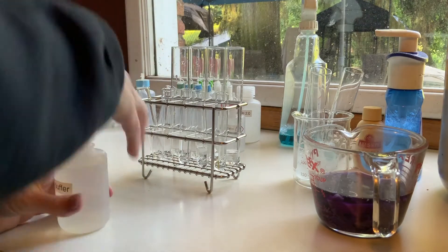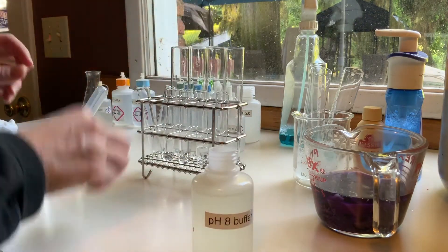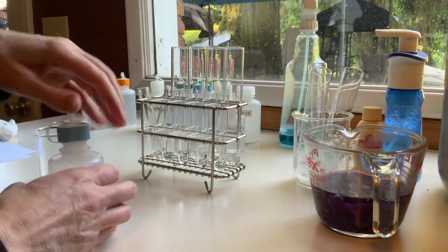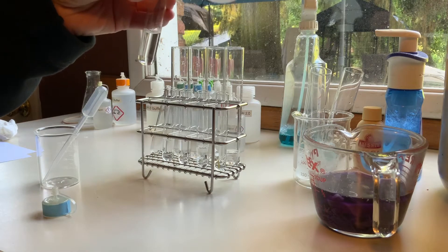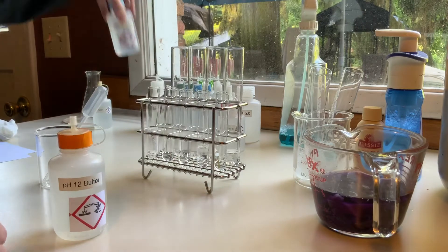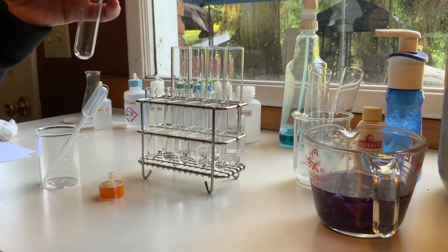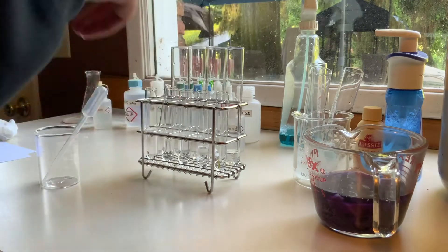Alright, page 8. And continuing with 10. After handling these and the lids, I'm going to go ahead and wash my hands.